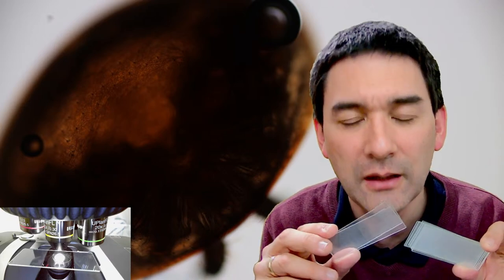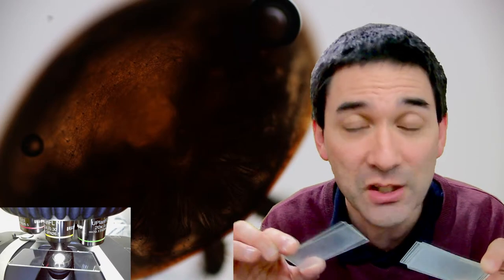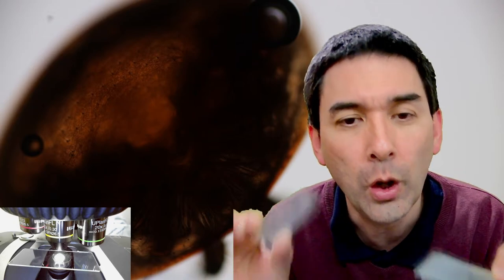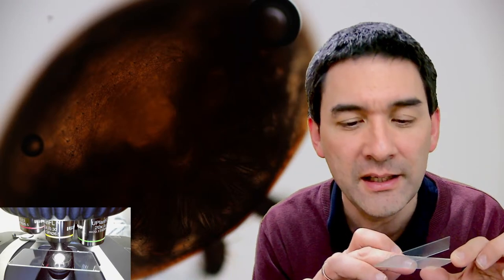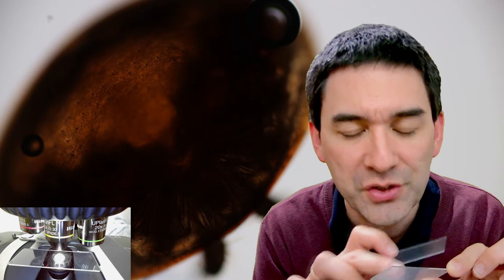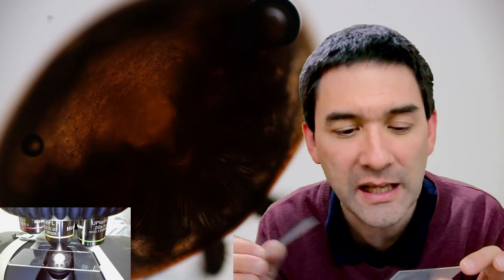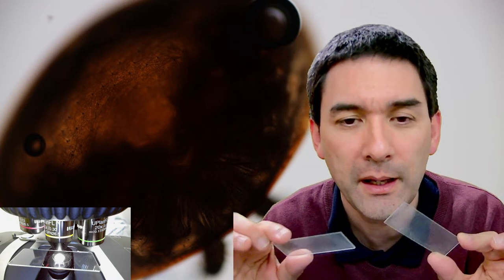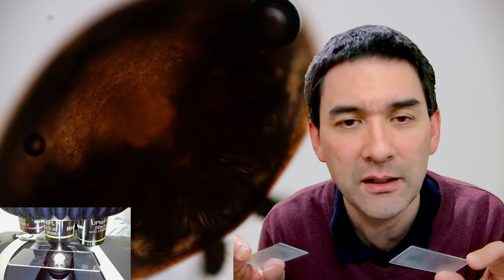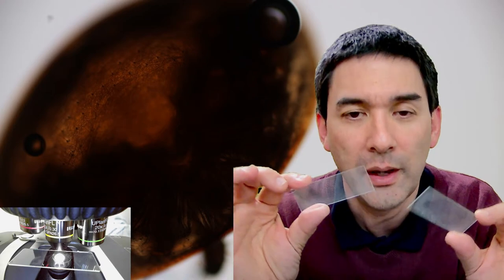And what I think happened is the following: water contains minerals, calcium carbonate, for example. When you wash the slides and there is water on the slides and it dries on the slide, then all of the minerals that are in the water will deposit on the slide. And then you have to use acid, which dissolves calcium carbonate, and I think it might be calcium carbonate, I don't know, to remove it, okay? If you don't want this, then the company should have rinsed them in distilled water at the end. And I think this is my hypothesis why they look so white.